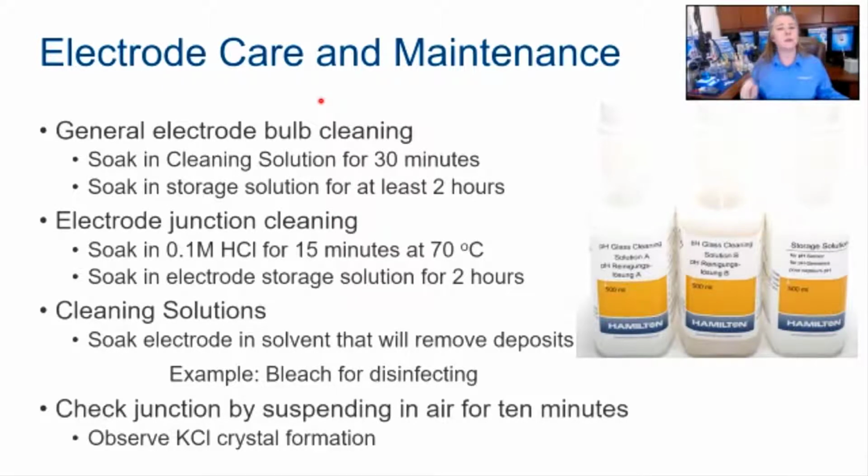It's actually a basic solution, so it helps offset. The B is for cleaning if your probe was exposed to basic solutions, so was your culture in the basic range. Leave it there hanging out, floating, not resting on the bottom.